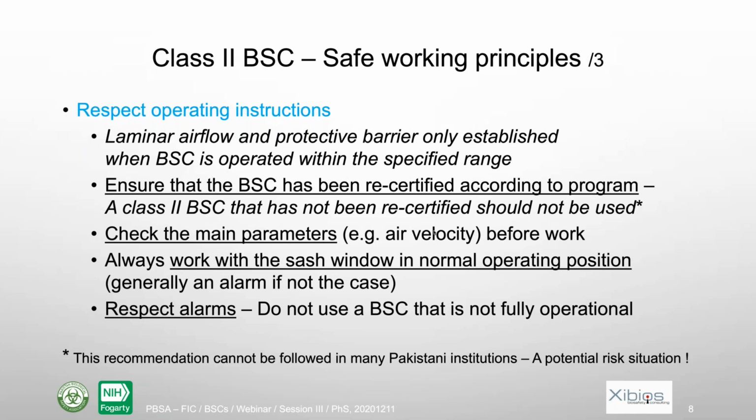A second working principle is to respect the operating instructions, meaning the instructions from the supplier or from the manufacturer. Actually, the laminar flow and the protective barrier are only established, only work within a very clearly specified range of airflow velocity, the speed of the airflow, and also a range of air moves. If you are not in that range, you will lose protection, either personal protection or product protection.